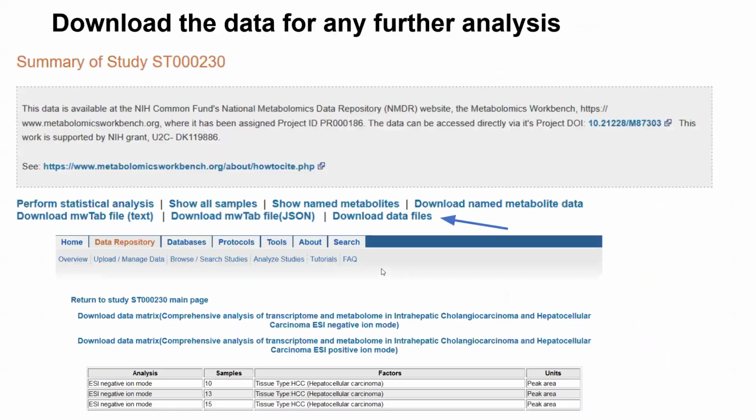So that is quite a good number of tools already available at the Metabolomics Workbench. But if the user is aware of other tools that are out there in the literature, or they have developed their own custom tool, they can download the actual data files and perform any additional analysis and interpretation.